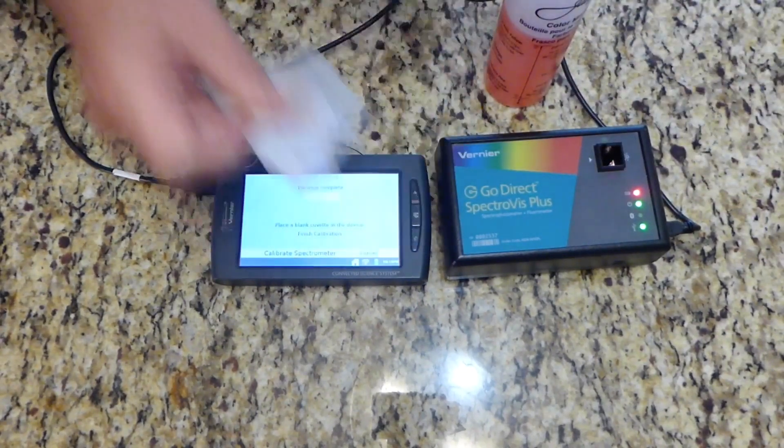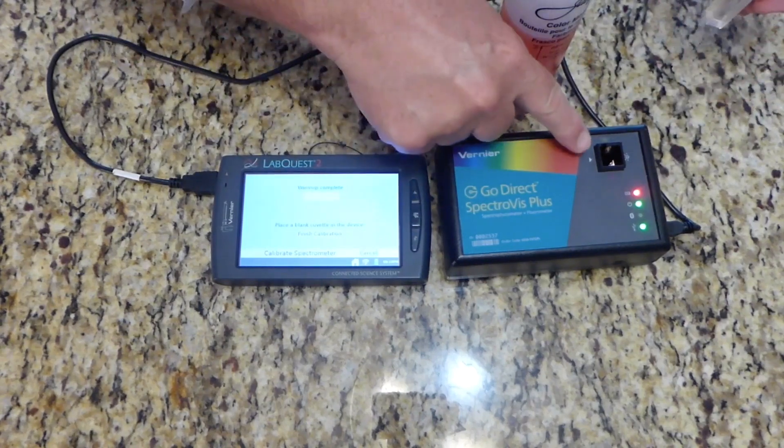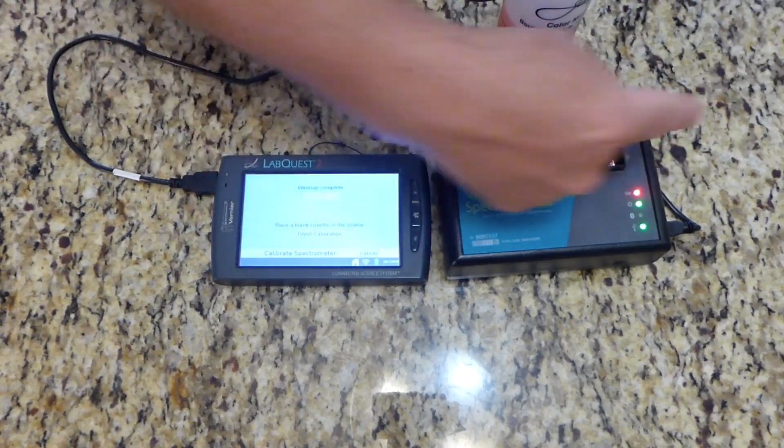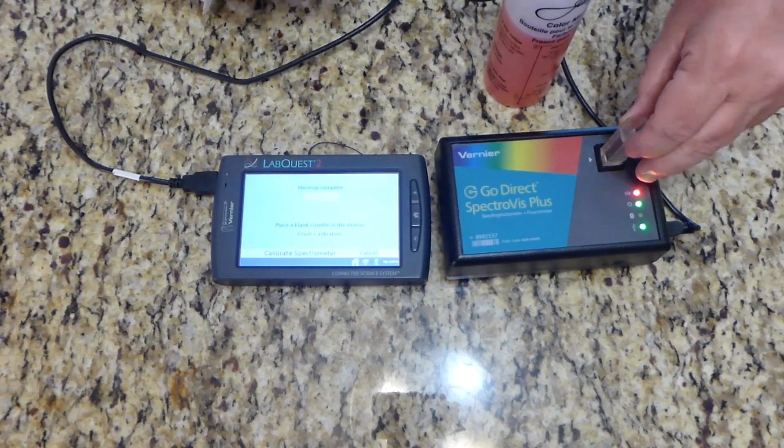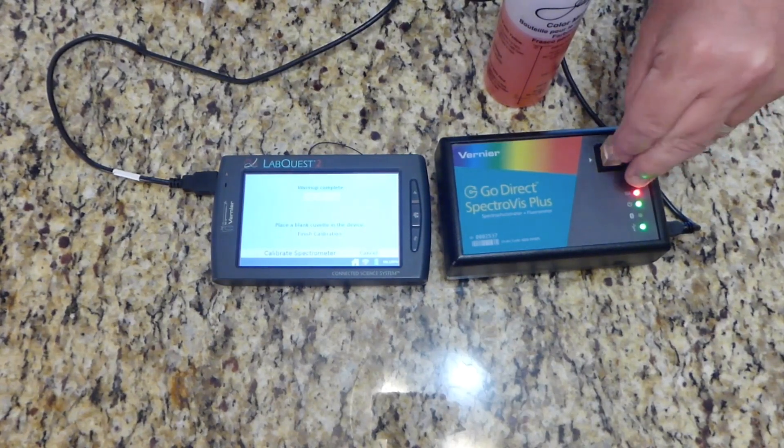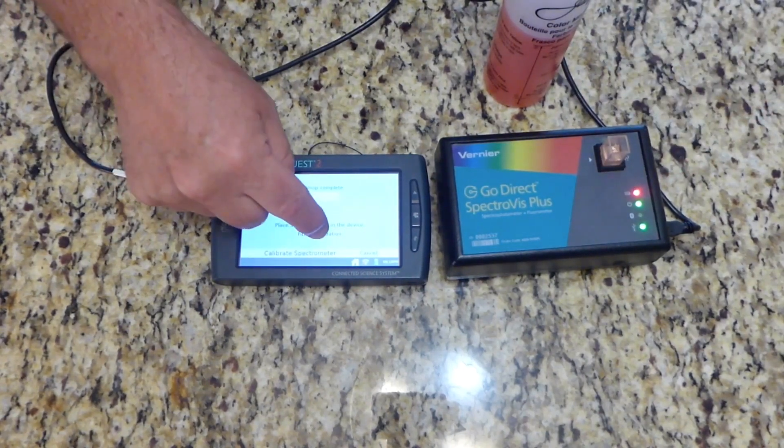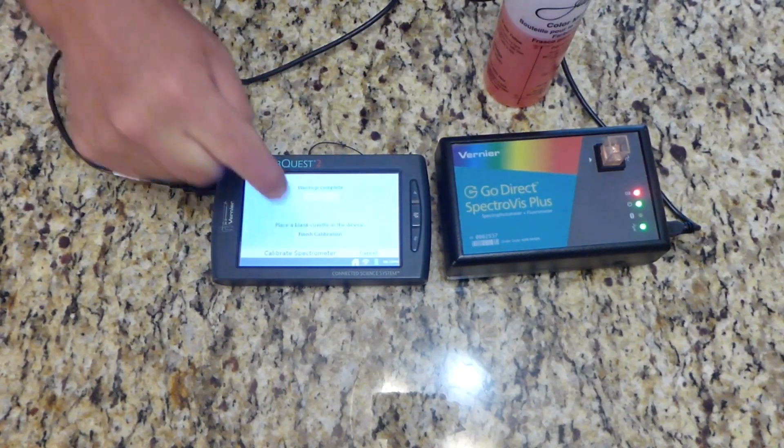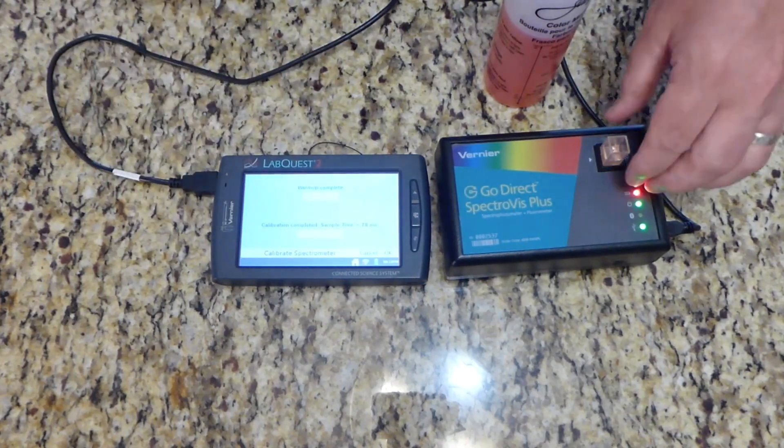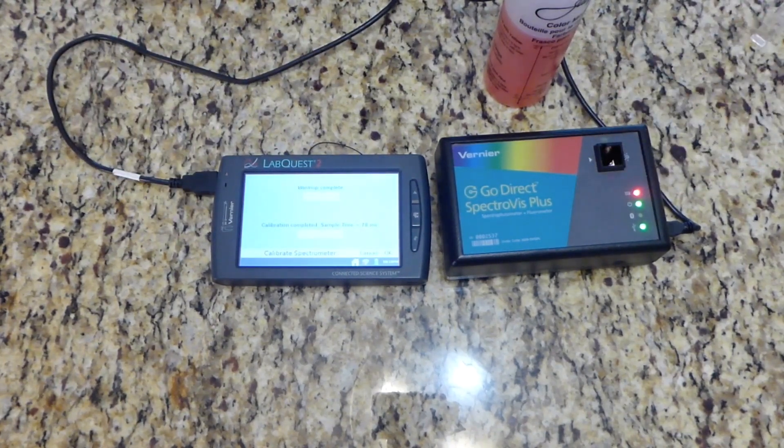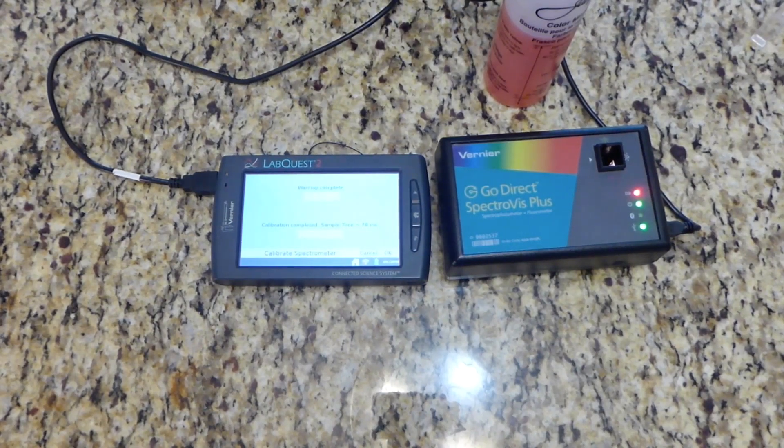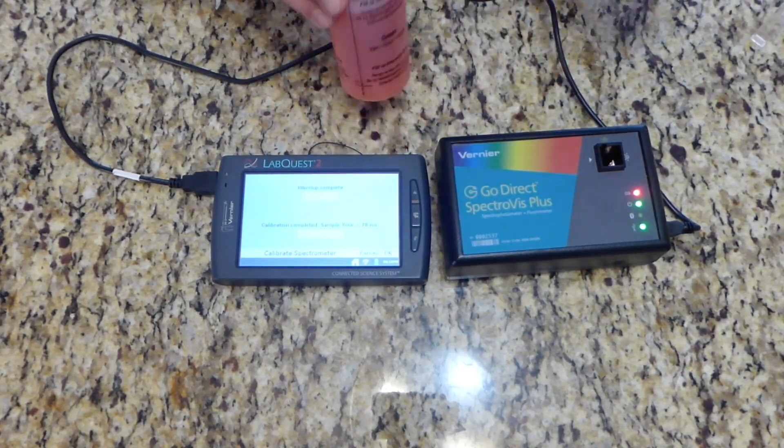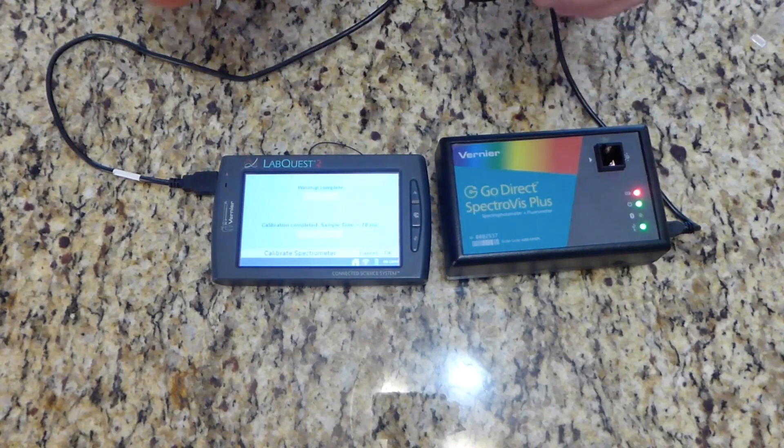After it's warmed up, you take your cuvette full of water, wipe it down. The arrow will tell you what direction it goes in. Pop it in. And you will hit finish calibration. And again, calibration just tells you this is what water looks like. So when you put in a different solution, it's not picking up on the plastic or the water. It's just picking up on the chemical that's in the water.